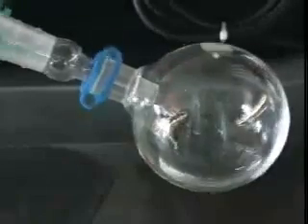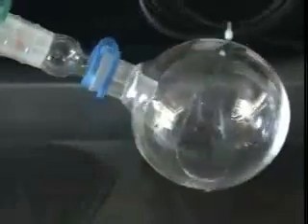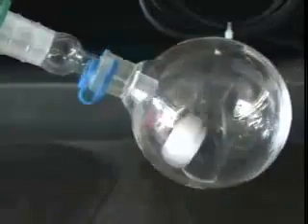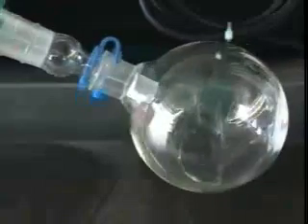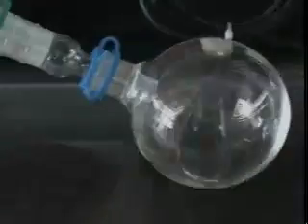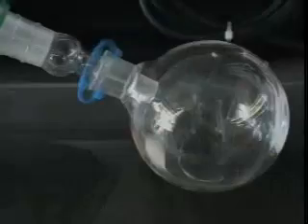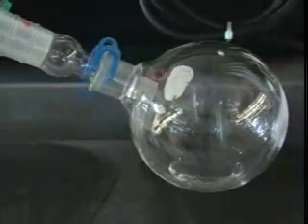Leave your flask on the Rotavap until the sample becomes viscous and sticks to the sides of the flask. Depending on the viscosity of your material, it may even form a ring around the middle of the flask. Solid material will most likely solidify when concentration is complete. Now you are ready to remove your flask. To do so, turn off the rotary motor, release the vacuum, and undo the keck clip. You can proceed to a high vacuum pump if you need to remove the small amount of solvent still in your sample.